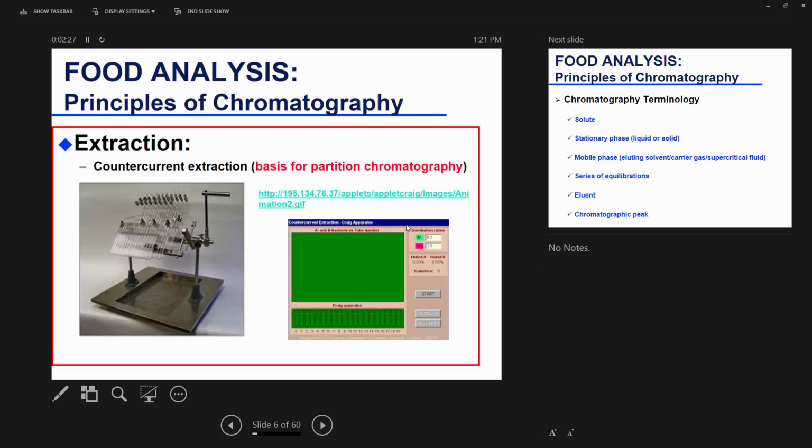And this is a peak because you have a certain concentration and they don't all come out. Not everything on the column is going to come out at the same second. They're going to be coming out until most of them are out, and then more and more is coming out until nothing is coming out anymore, and that would be your peak. Peak area, usually we correlate to concentration. And then the same for B. When I go over column chromatography, you'll get that concept even better. So we'll come back to that later.